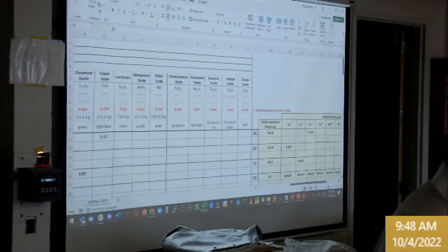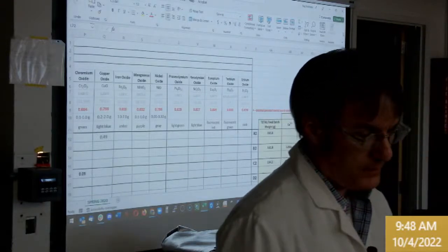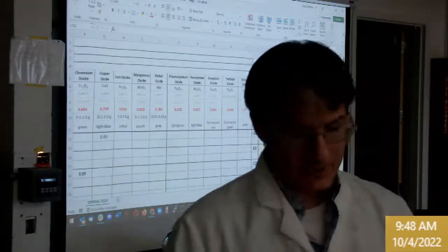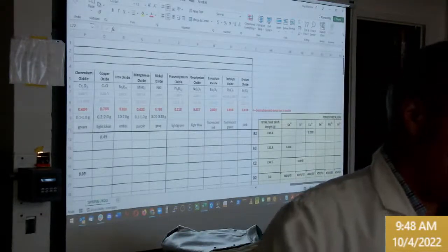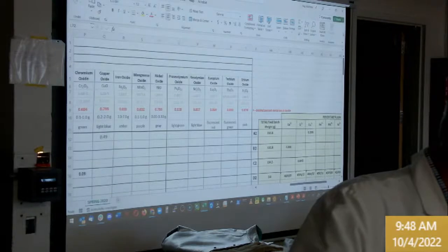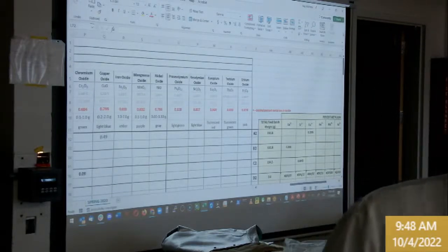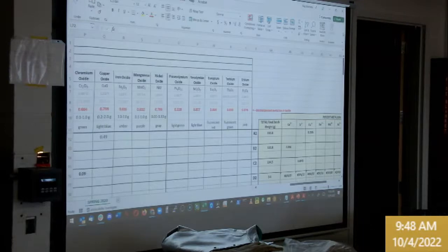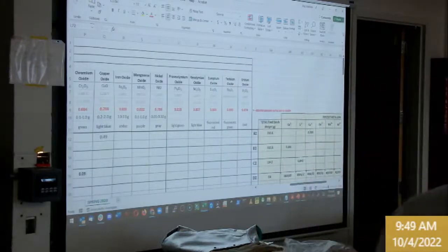So, stamp. It often is necessary to wear a glove to just give you a little bit of thermal shielding. Believe it or not, the radiant heat is pretty wicked on some of these. So you kind of move in, push. That's all it takes, but having one of those blue gloves helps knock down some of that heat. That's the first die set for composition A2 that would be needed.